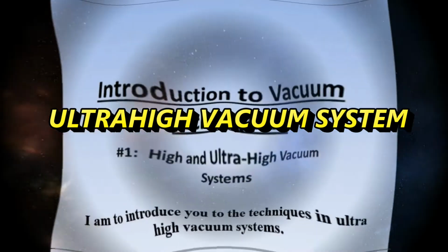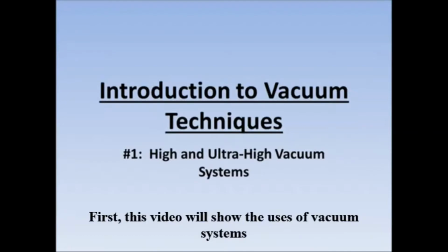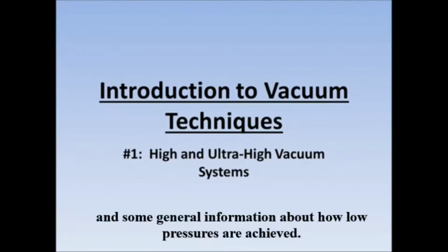Vacuum techniques. I am going to introduce you to the techniques in ultra-high vacuum systems. First, this video will show the uses of vacuum systems and some general information about how low pressures are achieved.